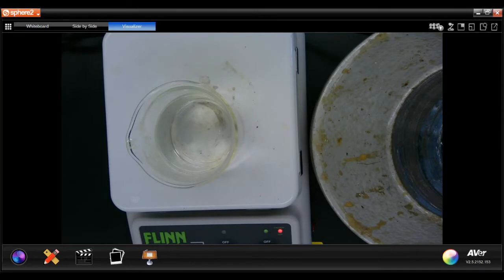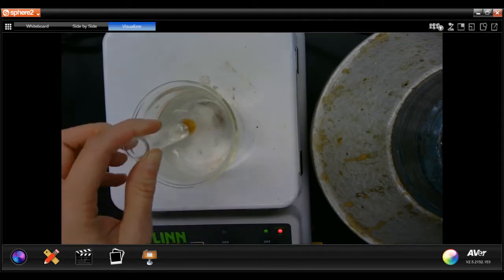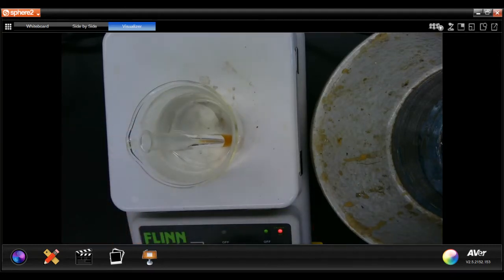So it is basic. I'm going to add 3 more drops of sodium hydroxide and then put it in the hot water bath. It is going to sit in the hot water bath for 3 minutes.